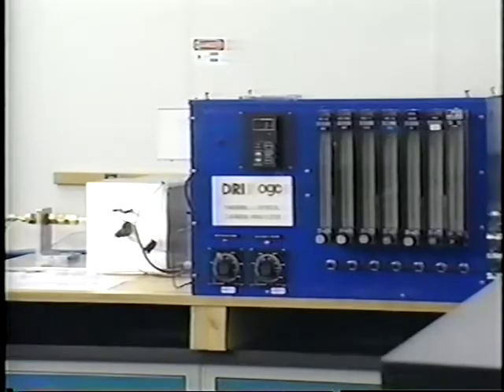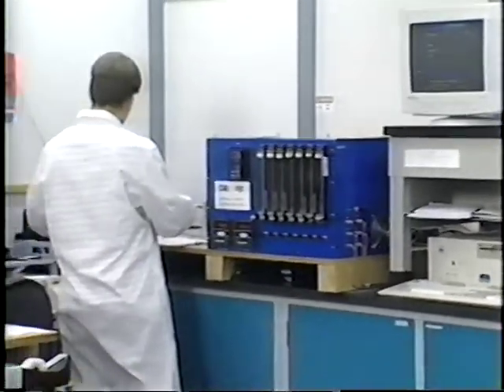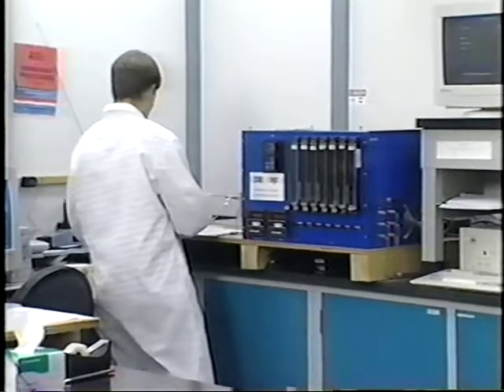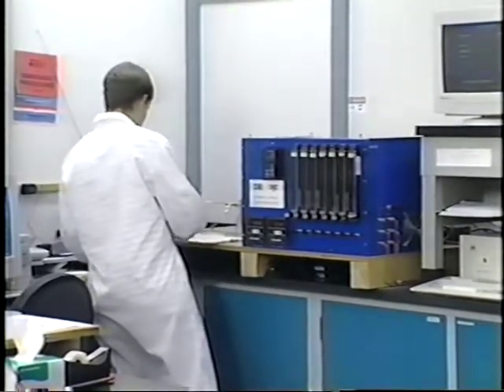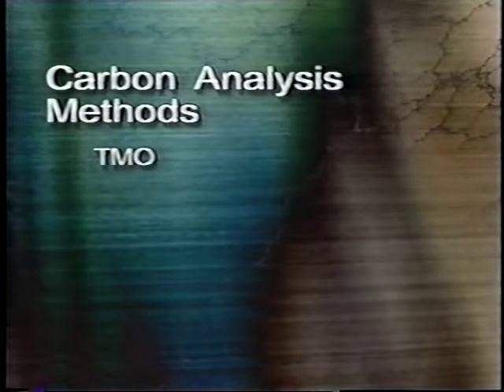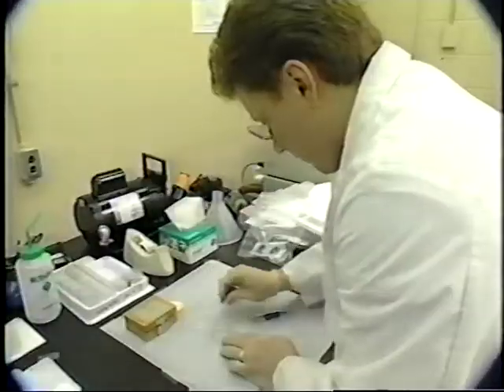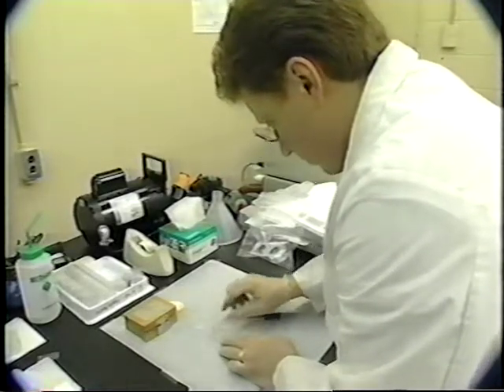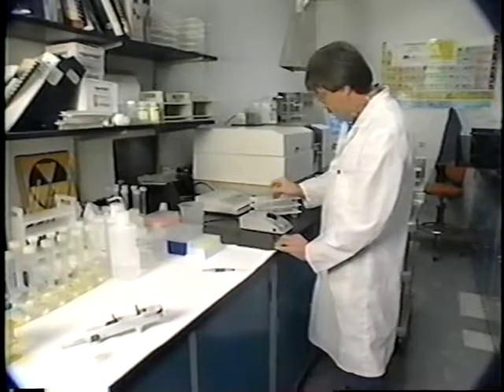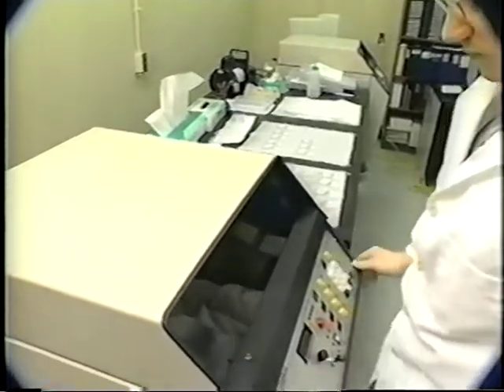measured. In addition to the use of these methods, Teflon membrane and quartz fiber filters can be submitted to a light transmission measurement before and after sampling on a transmission densitometer. This method only applies to light-absorbing carbon. The TMO method uses manganese dioxide present and in contact with the sample throughout the analysis. With respect to these methods, laboratory analyses for the mass, elemental, ionic, and carbonaceous properties of suspended particles have matured. They can now be performed with commercially available instruments, following established standard operating procedures and with traceability to common standards.